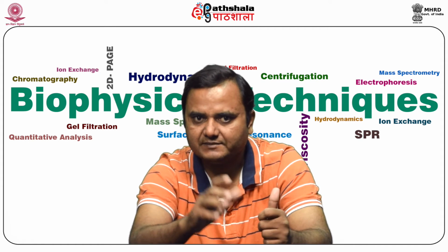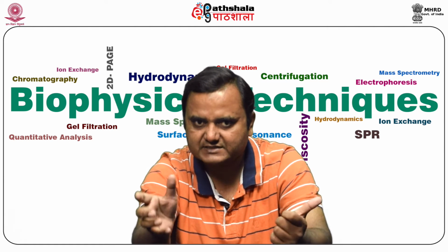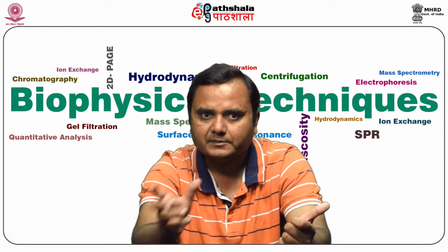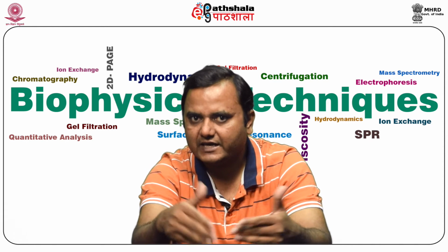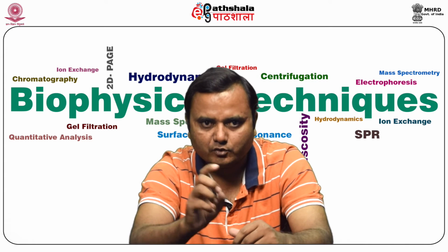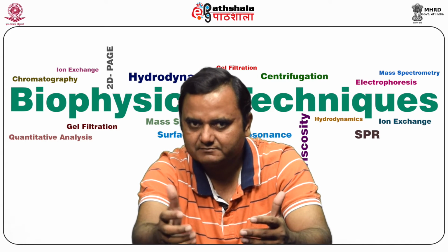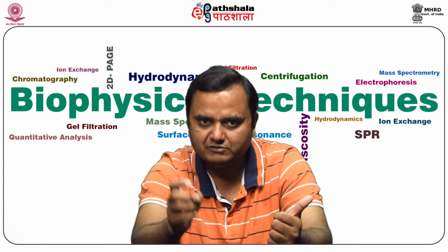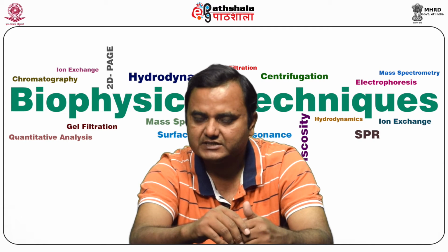So V is the sedimentation rate, d is the diameter of the particle, meaning the size of the particle, rho p is the particle density, rho l is the liquid density, meaning the density of the medium, mu is the viscosity of the medium, and g is the centrifugal force.